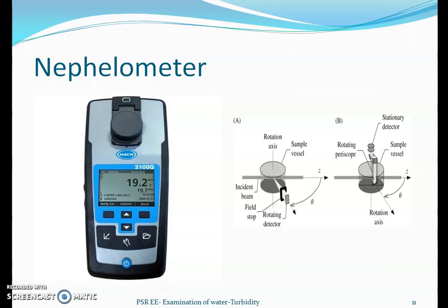Then we will be able to test these things, and it is going to stay for 1 to 2 weeks. Up to 1 to 2 weeks it is going to have an equal number of size and shape of particles, and the stability is going to be very good.